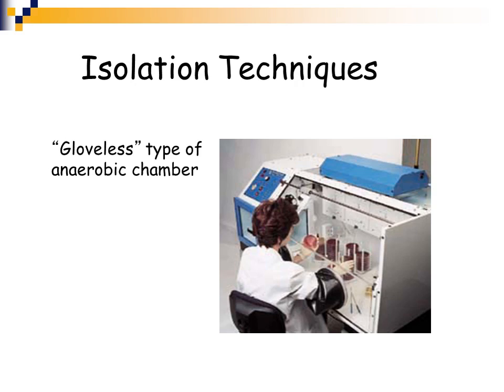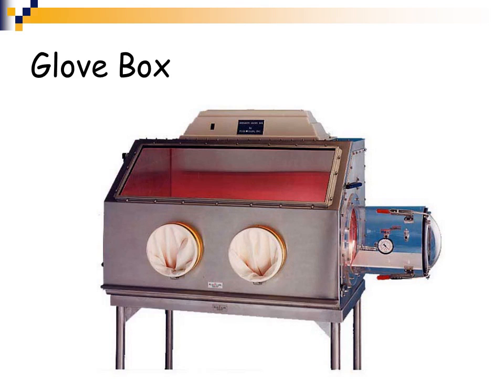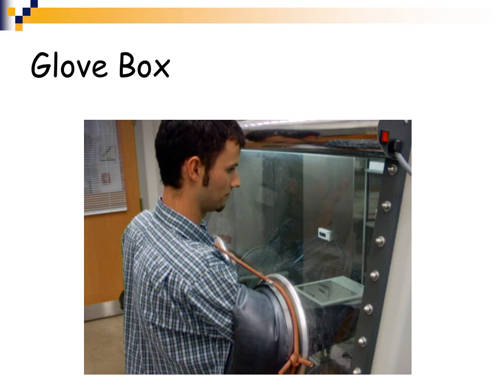This is a gloveless anaerobic chamber. So you would actually stick your hands through, and you're actually touching the specimens just like you would normally. And there is the catalyst that's constantly removing oxygen from the atmosphere. Here's another glove box where you would stand up and put your hands through the gloves and look into it, and everything would go into the chamber from that airlock on the right hand side. And again, here's someone actually working in a glove box.